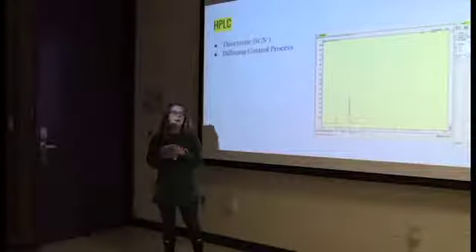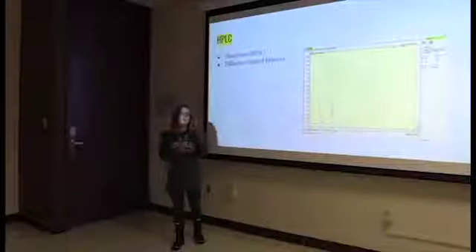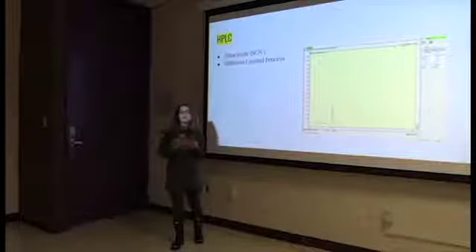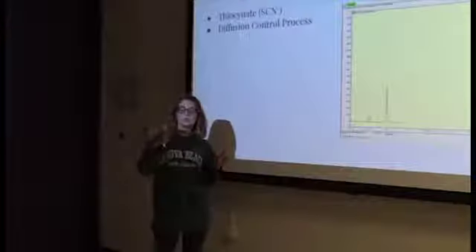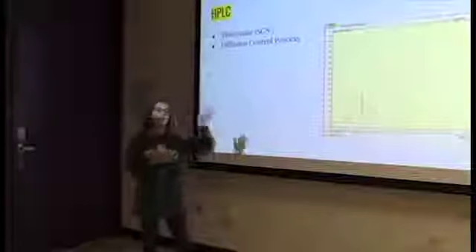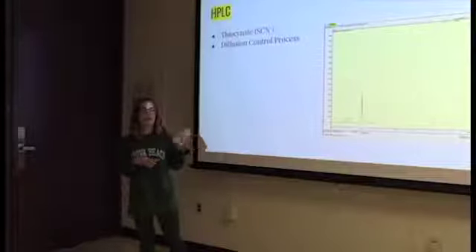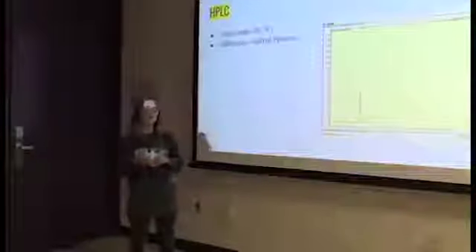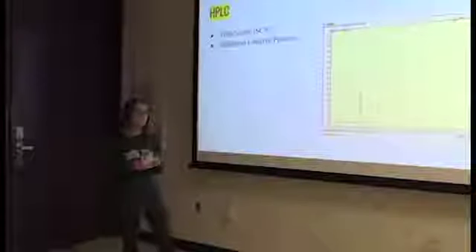When you increase the thiocyanate concentration to 1-to-2, that peak goes up to about 900, and then when you increase the ratio further to 1-to-3, the peak goes up to 1300, which is why we then used the 1-to-3 ratio for curcumin and iron, and it did prove to support that information.